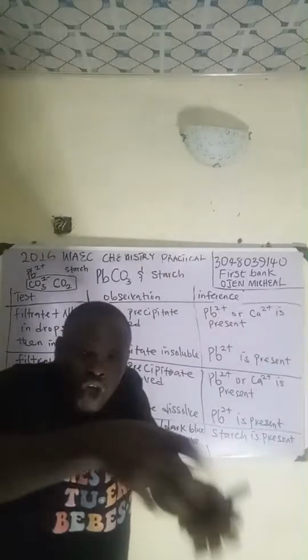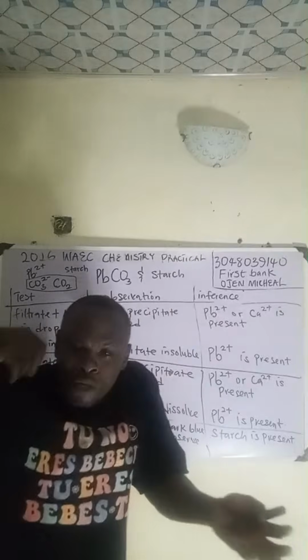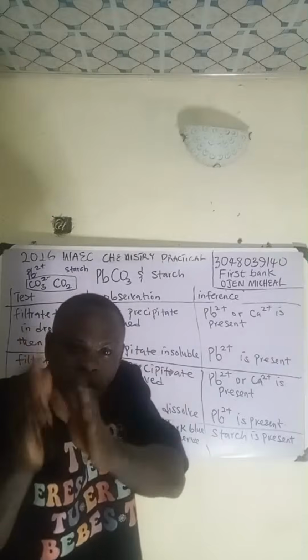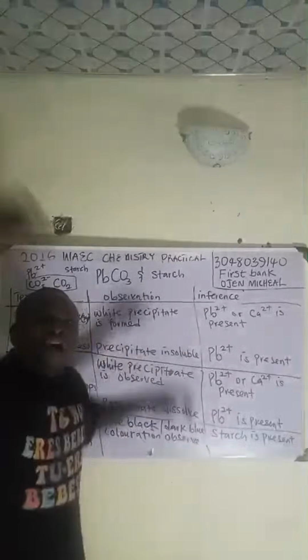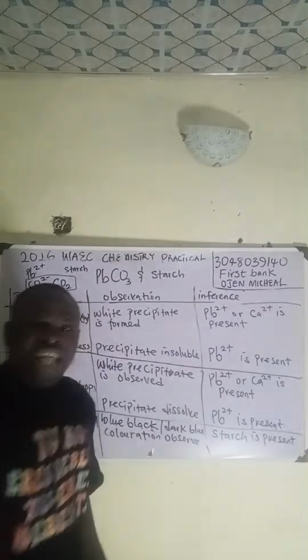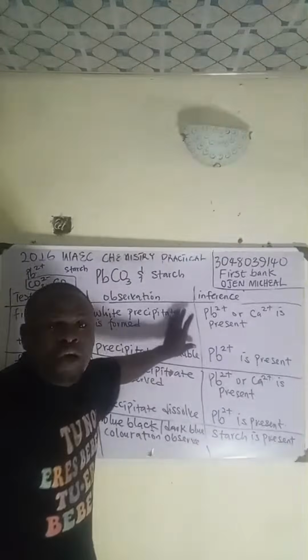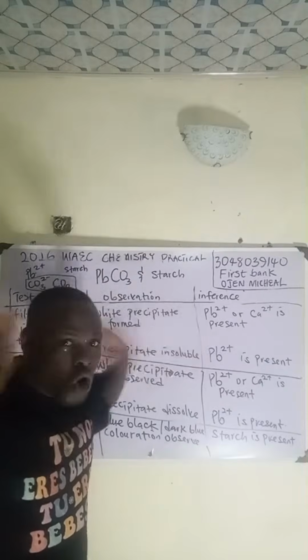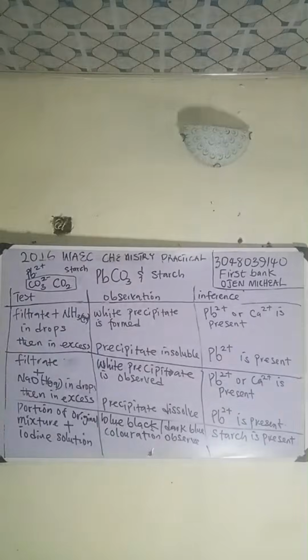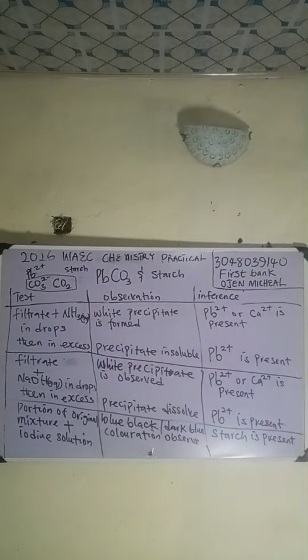That original mixture, don't carry some of the mixture now, carry the mixture out. They will ask you to use the other mixture and dissolve. Then the other one is that you don't dissolve, you use it for the test of starch. They cannot ask you to use the one that you have already dissolved in water, or use acid. Do you understand? Because that one, the temperature has changed.